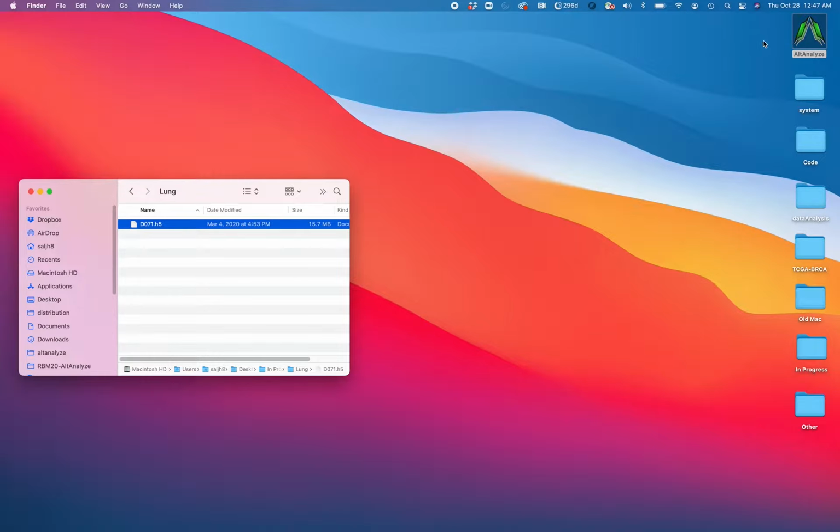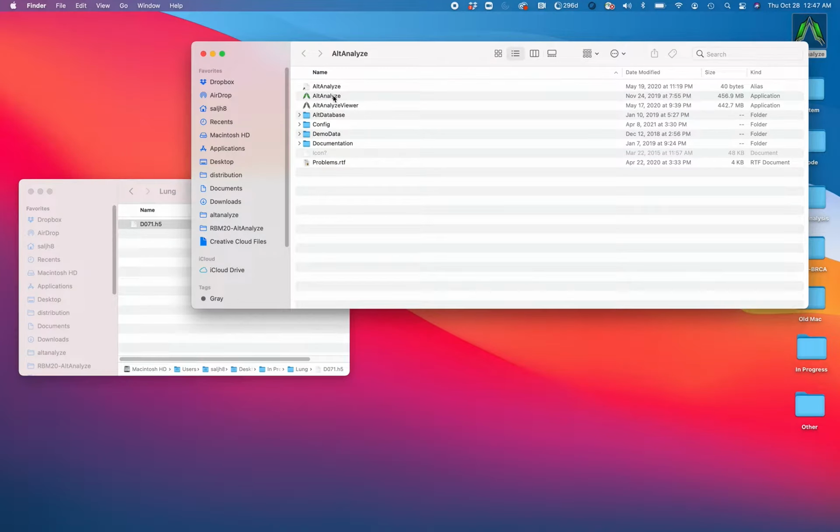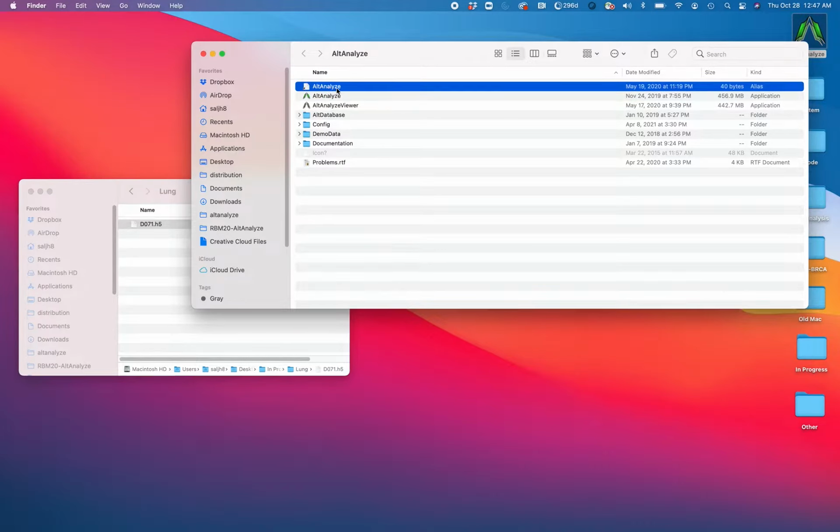Before you begin, you'll need to have AltAnalyze installed. So download that program if you haven't already installed it from the AltAnalyze website. Once you've extracted it to your computer, typically on a Mac or a PC, you're going to open the program folder. You're going to find the green AltAnalyze icon on a Mac or the white AltAnalyze icon. Sometimes the green AltAnalyze icon doesn't work depending on your system. On a PC, you're going to double click on the altanalyze.exe.